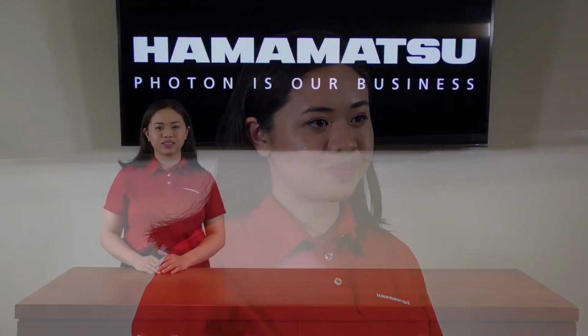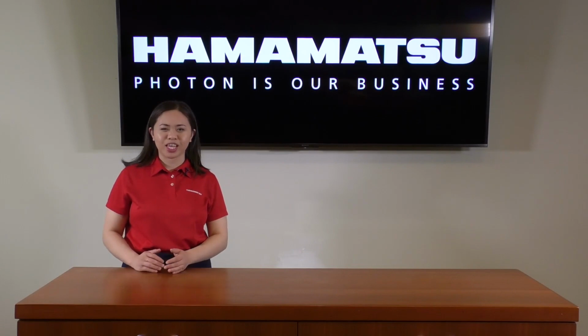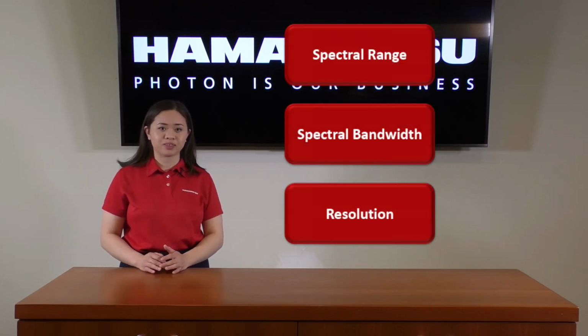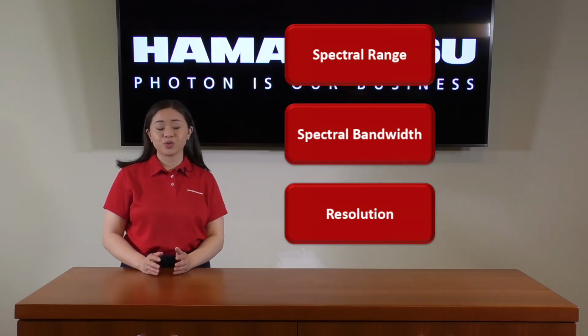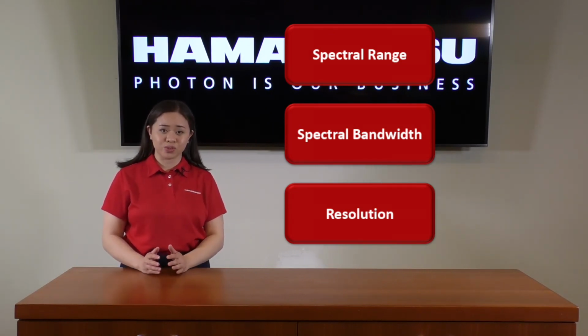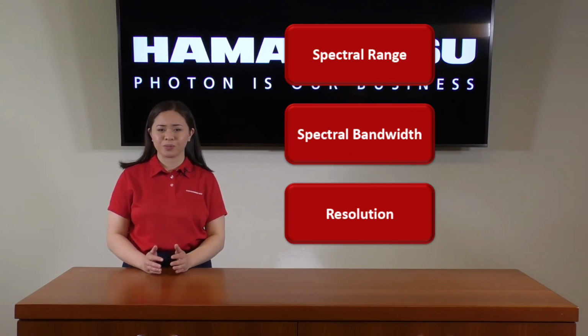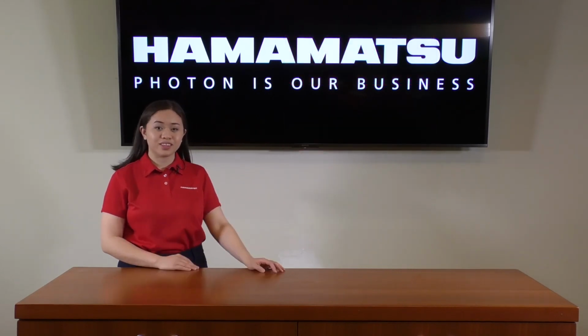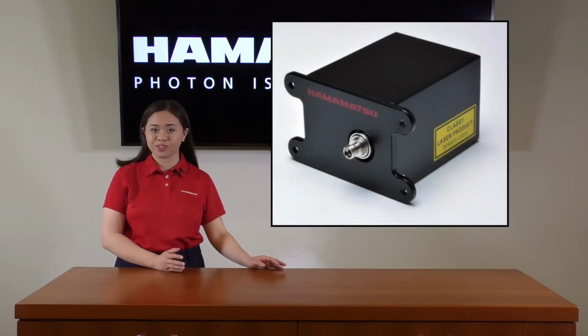These options are designed for compact and seamless integration of spectroscopic measurements in different regions of the NIR. When selecting a spectrometer, keep in mind that with different ranges of spectral sensitivity and different spectral bandwidths come varying windows of visibility to study the sample. Also pertinent is to take note of the resolution required. How far apart are the peaks of interest? Will the spectrometer you've selected have the resolution required to separate these peaks? The FT-NIR engine is used for our first test.